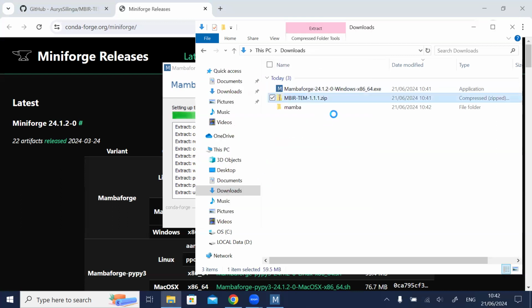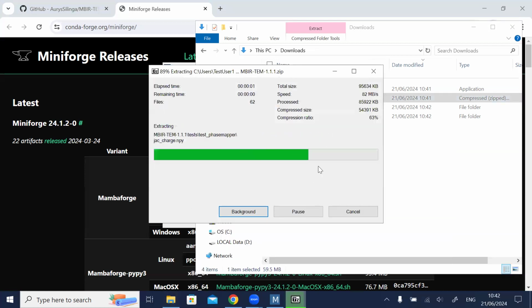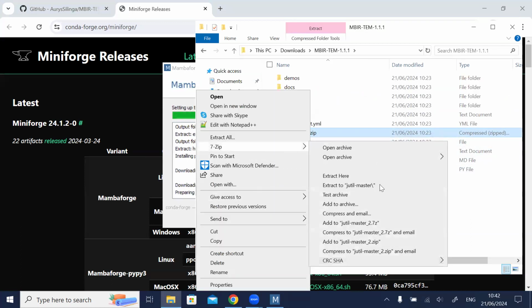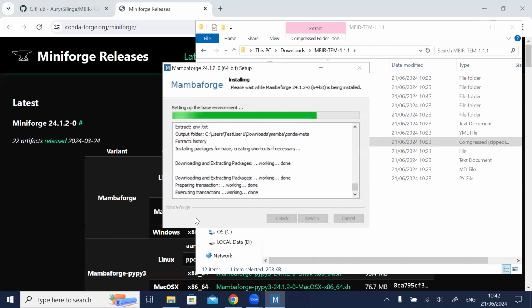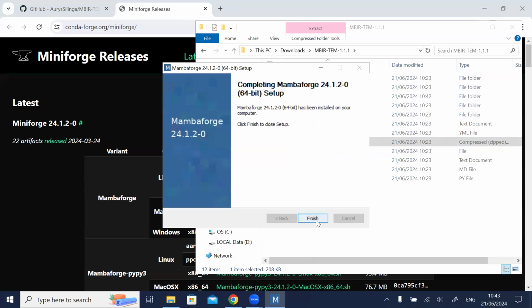And while we're at it, let's extract all the source code. And later on, we will need this as well. The other videos in the series will show you how to do the reconstruction itself. This is an extra lengthy one showing you every single step of the installation.